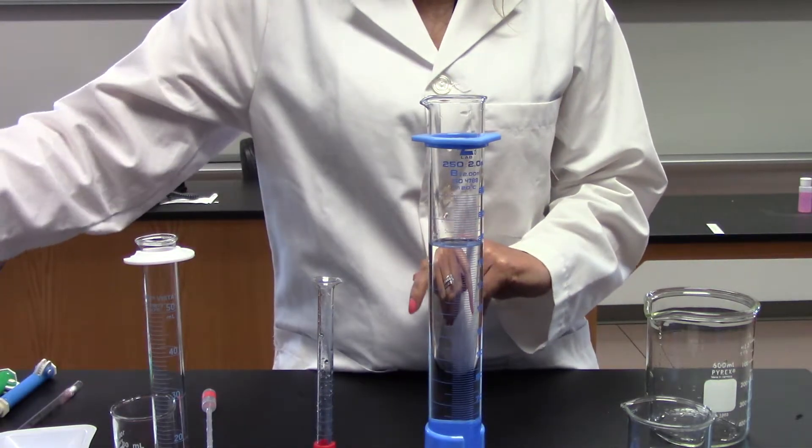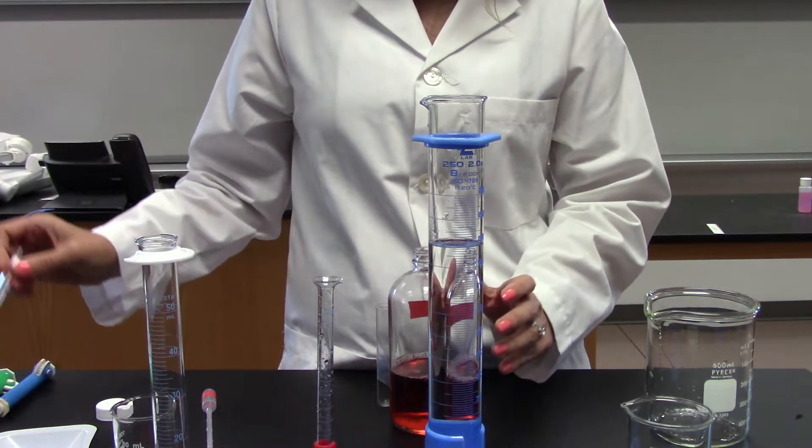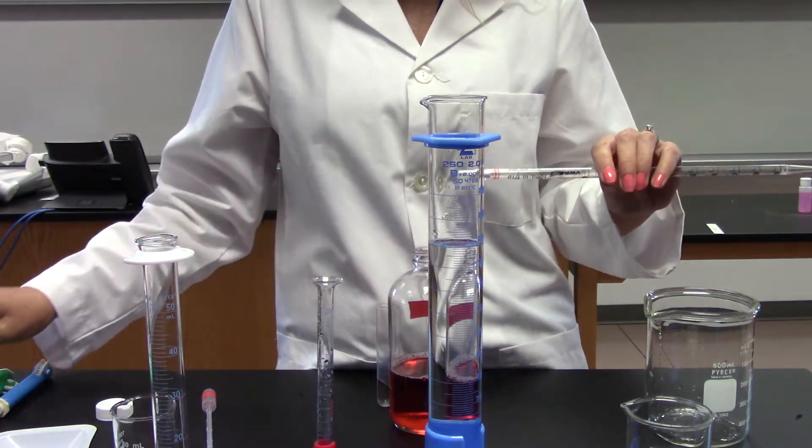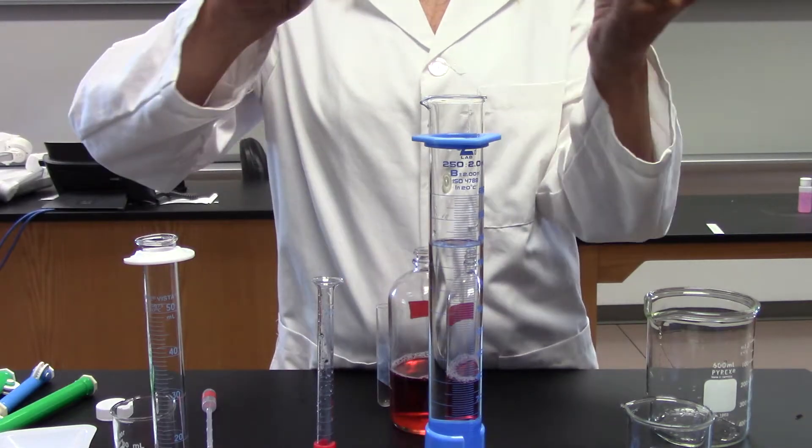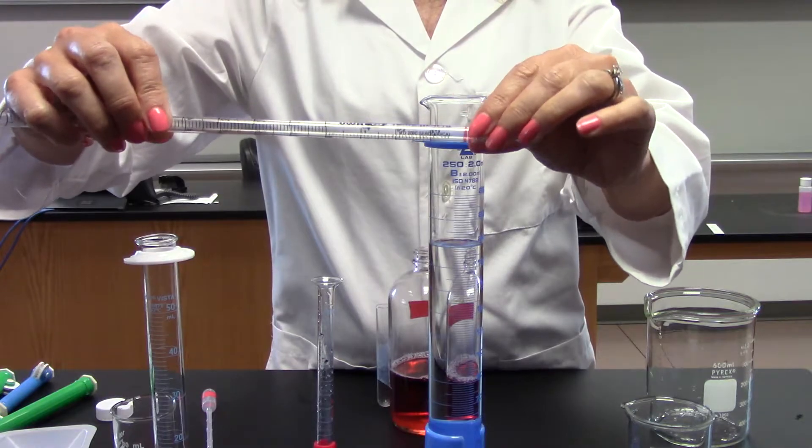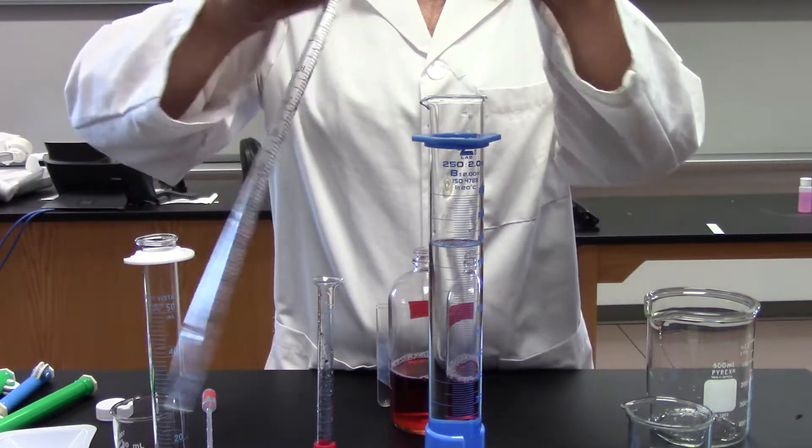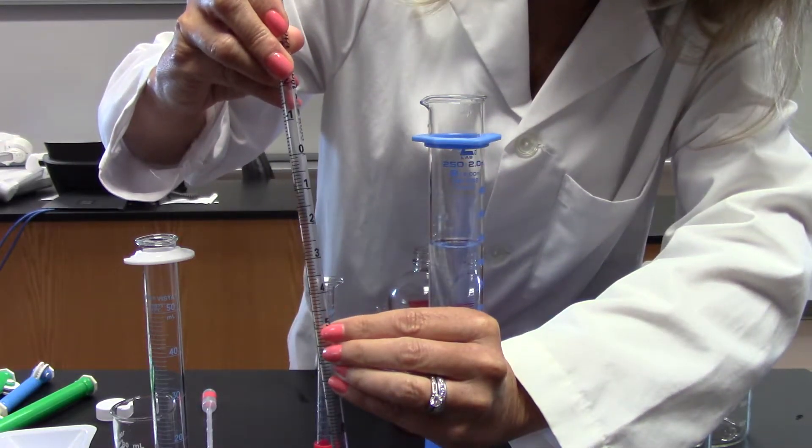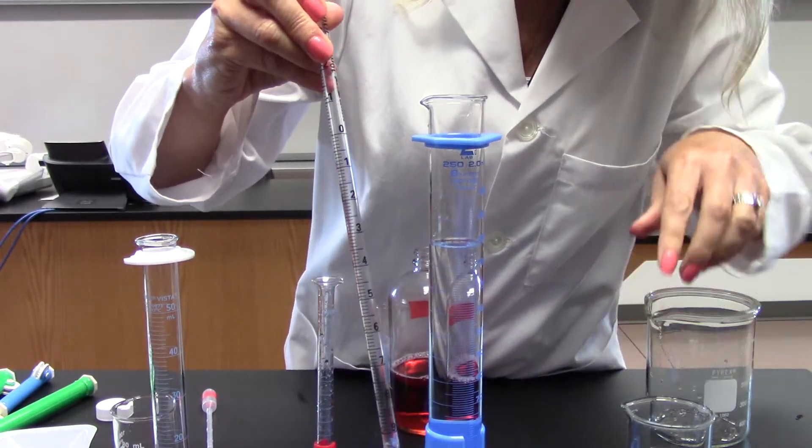I'm going to add some liquid to this graduated cylinder using a pipette. This is a 10 milliliter pipette. I know that because it says 10 milliliters right here. It also tells me that each of these graduations is one tenth of a milliliter, so each of these lines is a tenth of a milliliter.